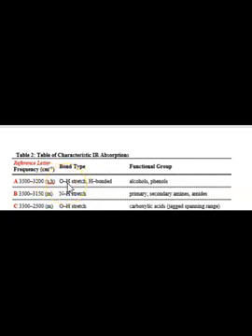In the molecule, you'll see that there's something called an OH stretch, and this H is actually stretching back and forth with this oxygen. And we've seen before that chemists would prefer that you think of these as springs, like a slinky, rather than a line or a stick. Okay, but if you get a peak in this region, then it says you have an alcohol in your substance.